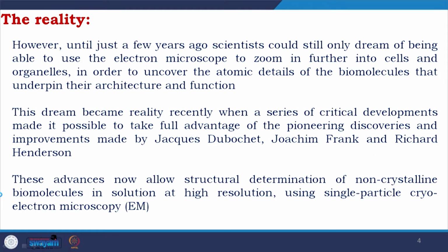Through this journey, I have repeatedly talked about how important it is to get the 3-dimensional structure of the biological macromolecule, especially protein. But the challenges we have already discussed about crystallography. It is a very convenient technique.